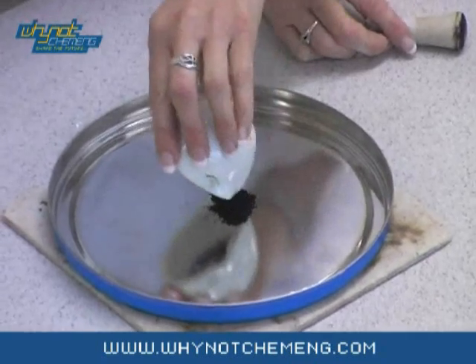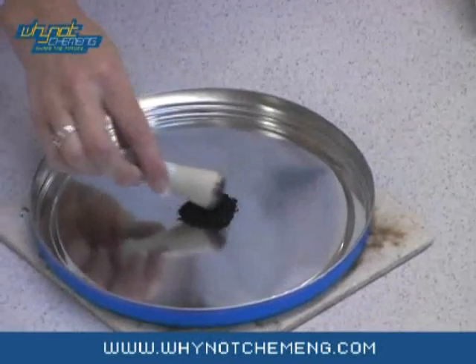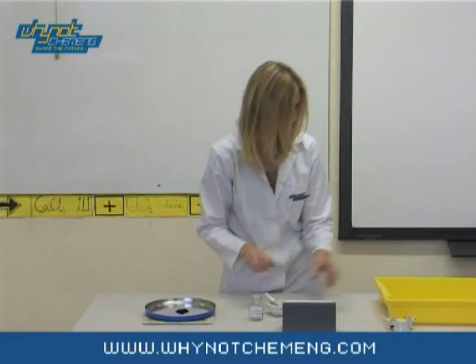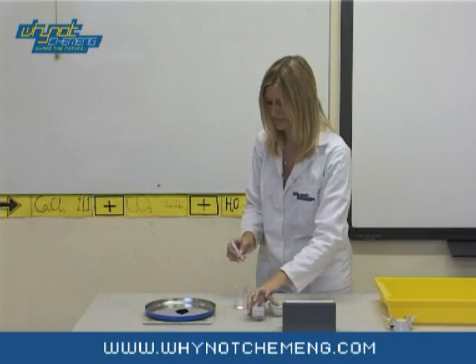Pour the crystals into a small pile on a tin lid standing on a heat proof mat. Make a well in the middle of the pile and add the glycerol using a syringe. The glycerol should be less than a year old — any older and it may not work.